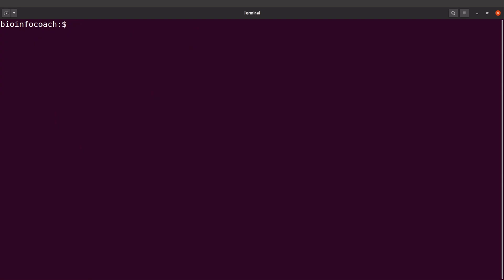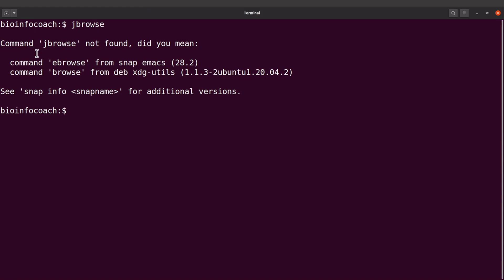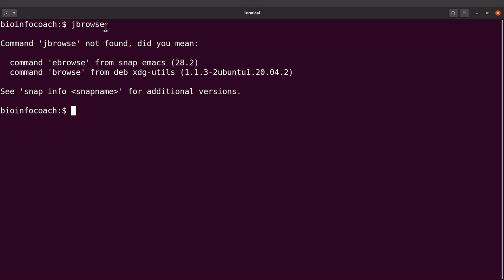With our current setup if we call jbrowse like this — just by its name — we get an error. We are going to resolve this by adding JBrowse to our PATH, so that we can call it by its name from anywhere on the system. That's what we are going to do next.